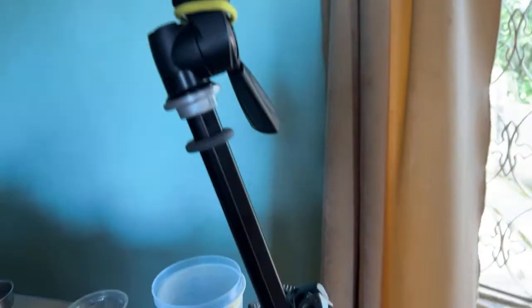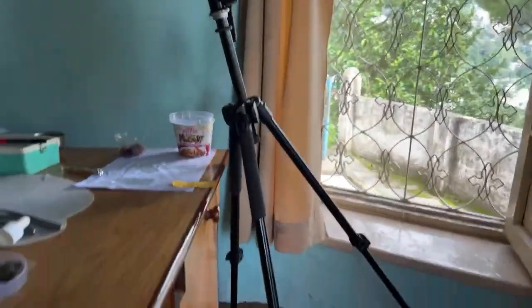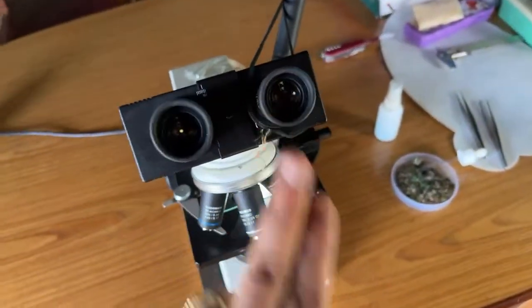So now what I'll do is I will mount the mobile on this tripod, which I have sort of inclined by some tweaks, and then I'll fix it here, and we'll keep on observing things. So let me do that for a while.